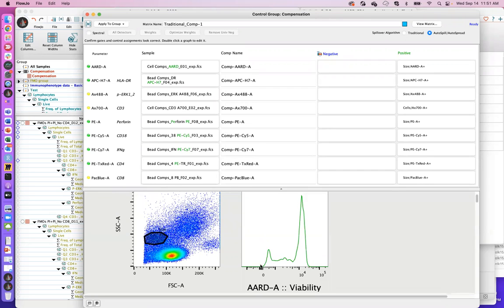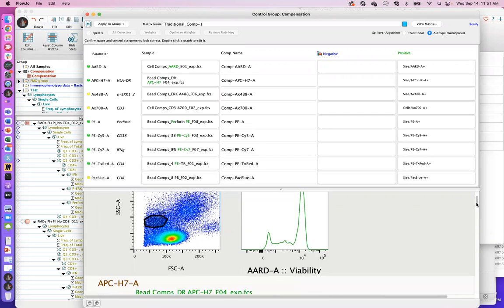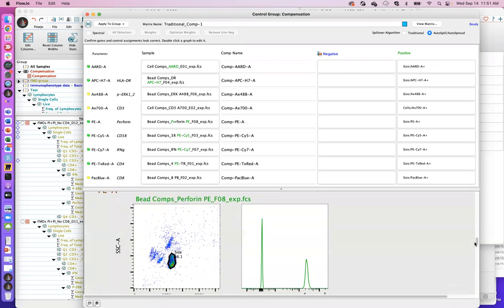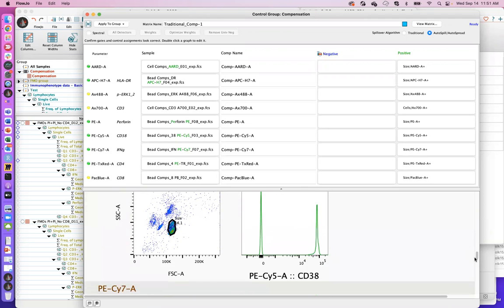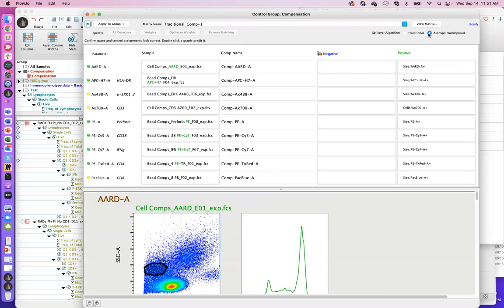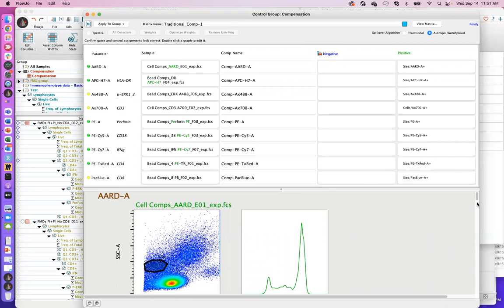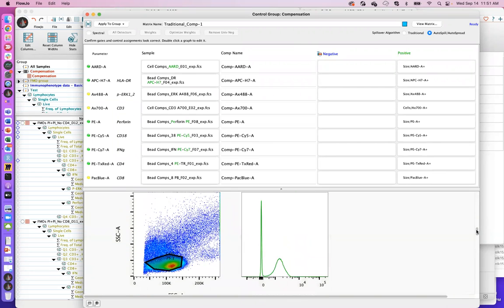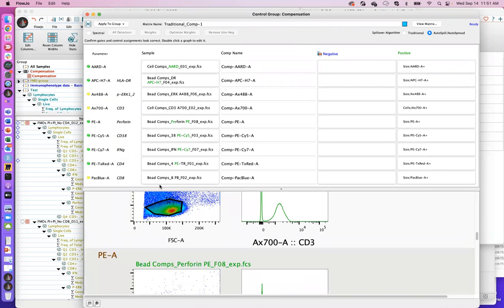It's just going to say which point is the furthest left. We're going to try and make that median the lowest point, and then we're going to adjust the regression curve accordingly as best we can with the data points that are presented to us. Okay, so auto spill, universal negative. Now you just go through the data to make sure you've got any spread if possible. Not much, as I said, we can do about beads.